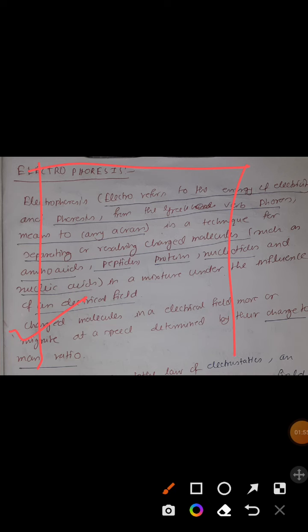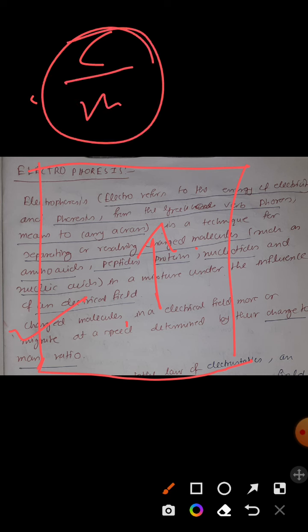Here we are using the electrical field to separate or migrate molecules, right? The charged molecule will migrate under the influence of the electrical field. The speed of that migration depends on the charge to mass ratio. The speed of any kind of charged molecule in the electrical field depends on the charge to mass ratio. That is the important thing.